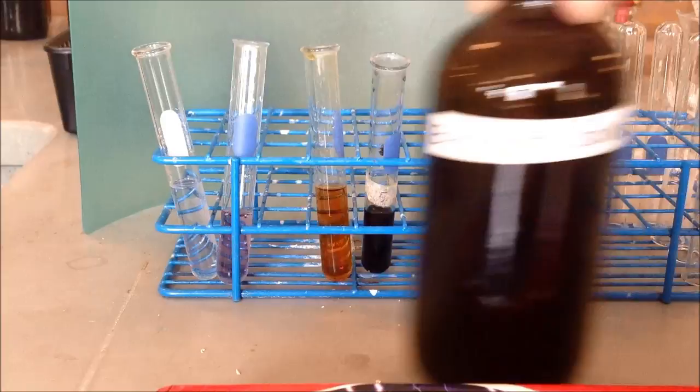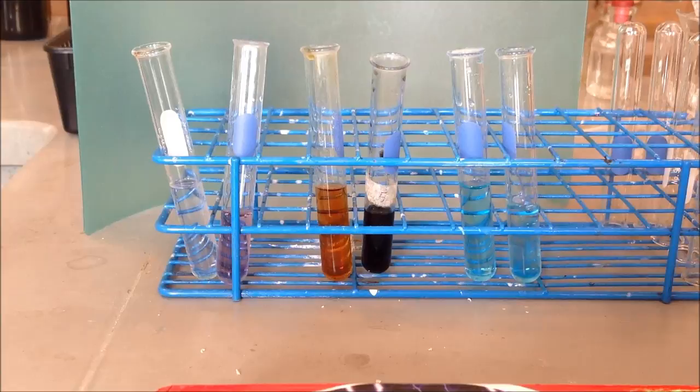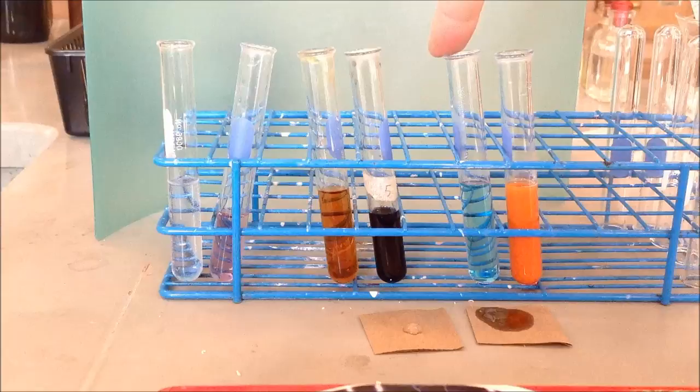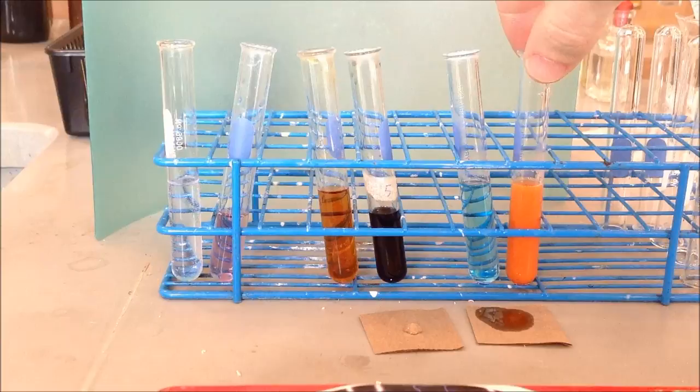I'll add some Benedict's solution to both the water and to the glucose solution, so it'll show us what a positive and what a negative looks like for glucose. This reaction actually takes some time and I have to heat it up in a hot water bath, so I'll do that and bring it back once the result is finished. The reaction is finished with the Benedict's — you can see the results. This is our water and Benedict's, our negative for glucose. This is our Benedict's and glucose solution, our positive for glucose. Benedict's turns this color in the presence of glucose.